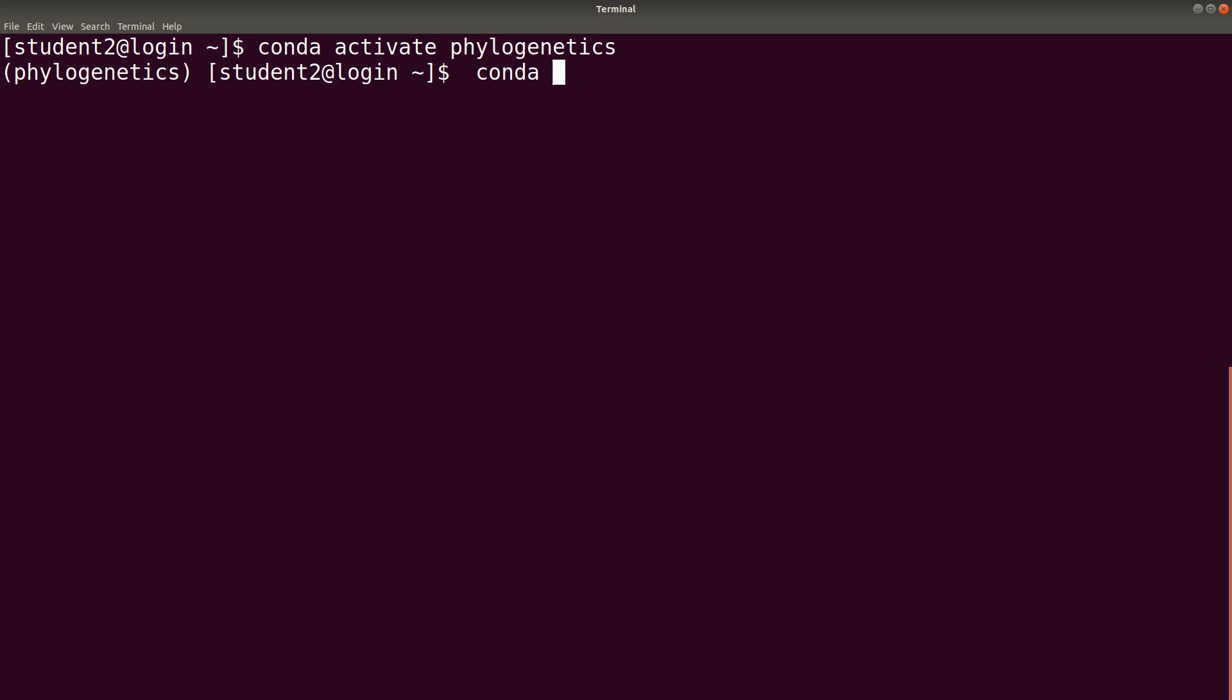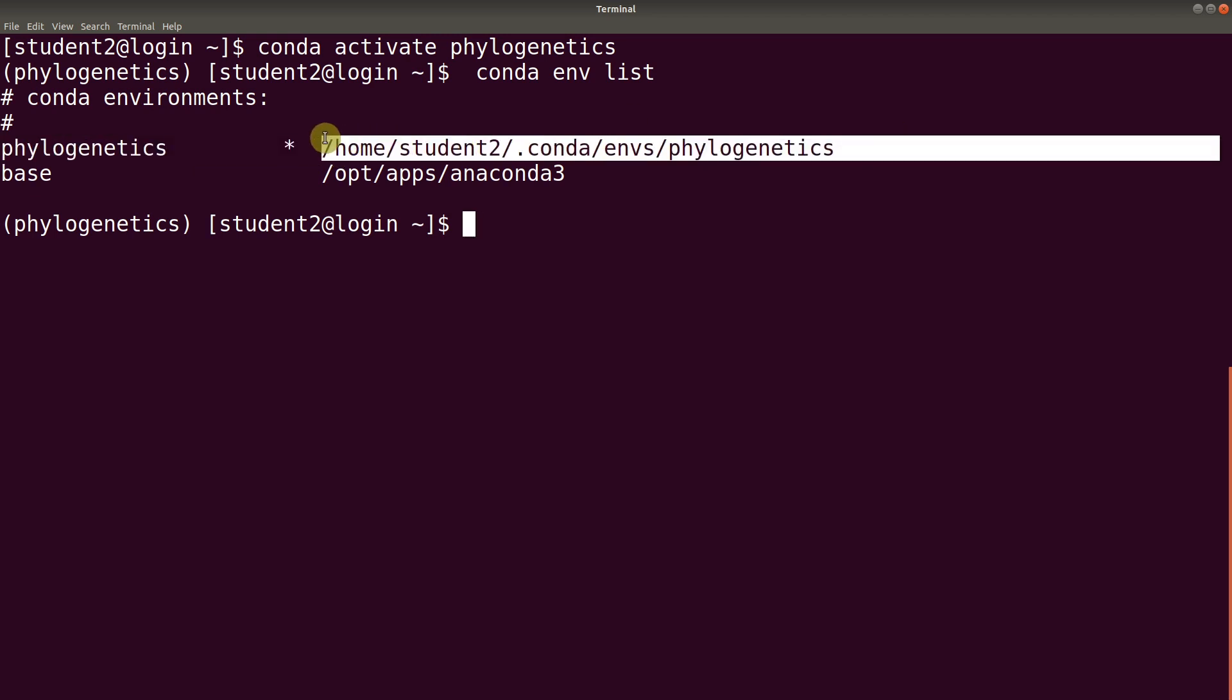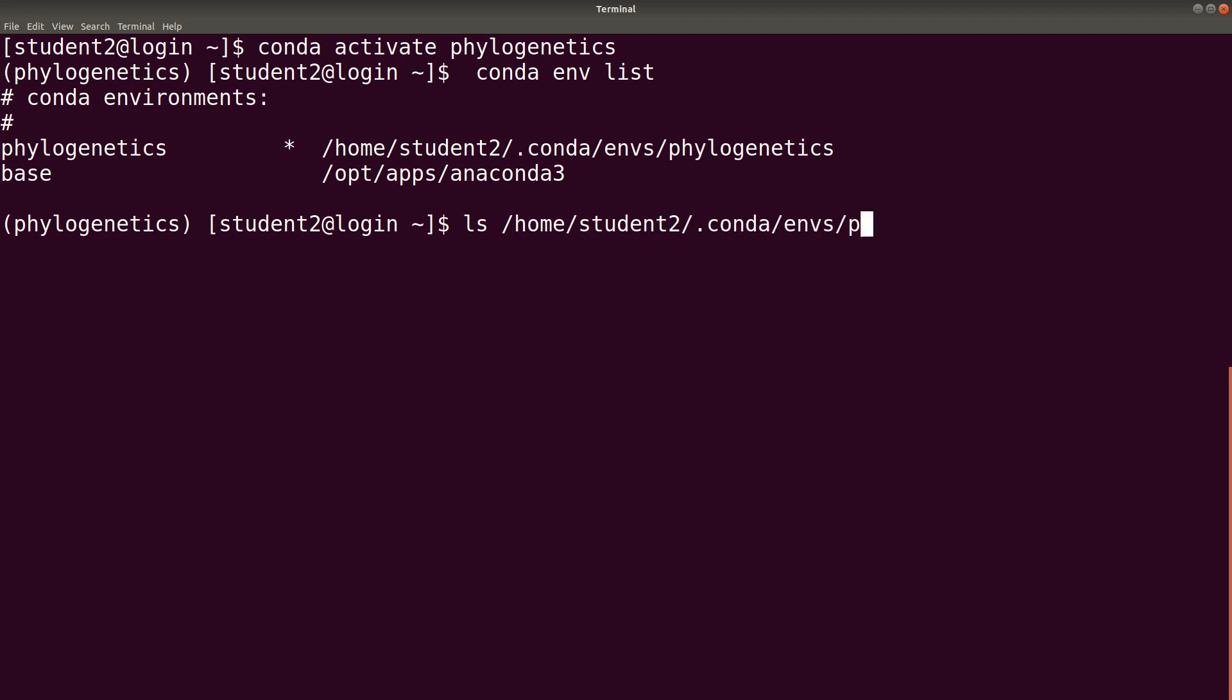We say conda env list. Then, we wait for the path to show. We have phylogenetics and there is a path. Now, with this path, there is a bin directory that is created within this environment. And that is where the tools will be installed to. So, we are just going to do an ls to display the contents of it. So, we say ls /home/student2/.conda/envs/phylogenetics.